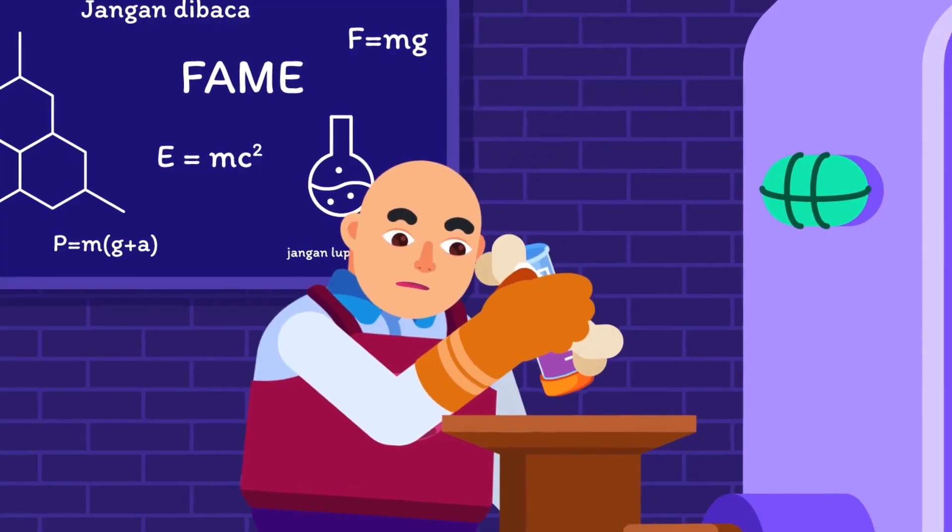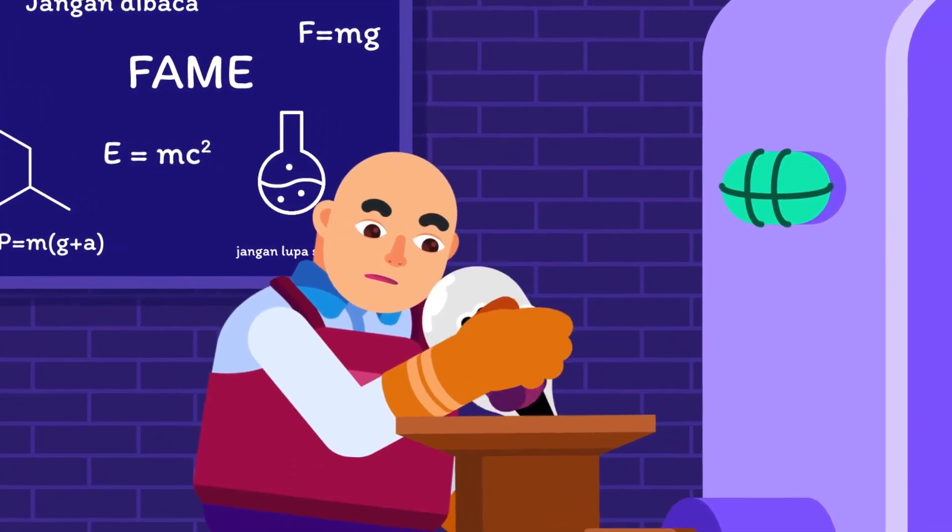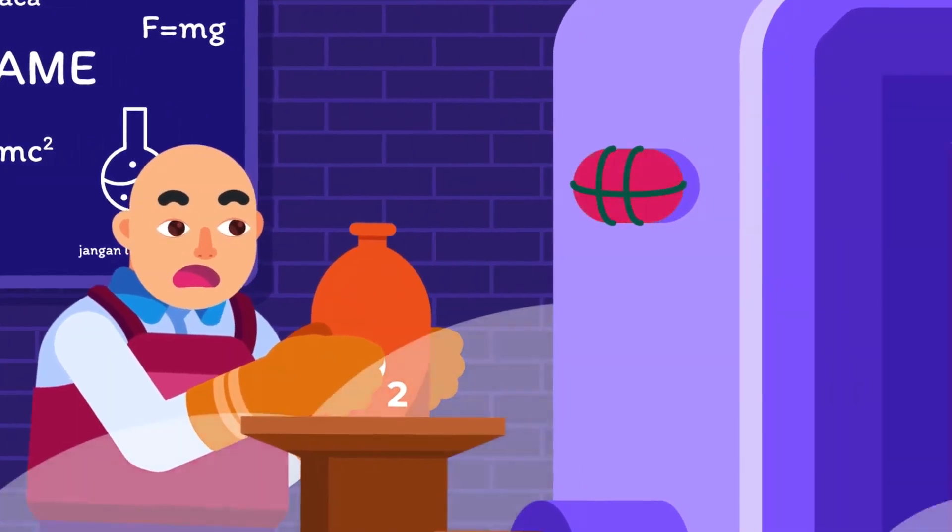Here is a tricky question for you: do you think the measuring cylinder can also be used to measure the volume of gas? Share your thoughts below.